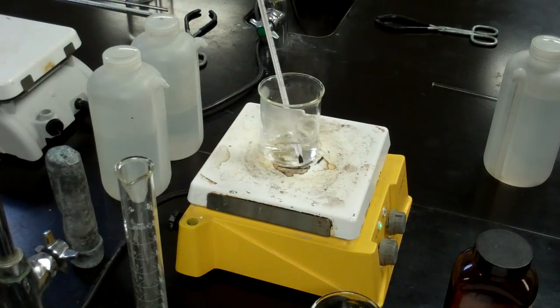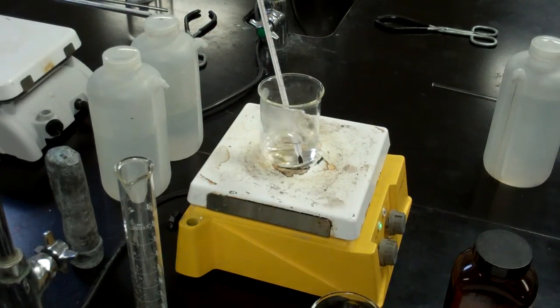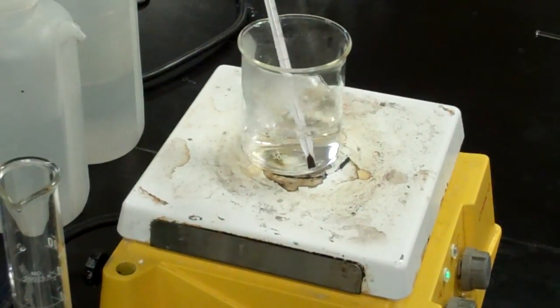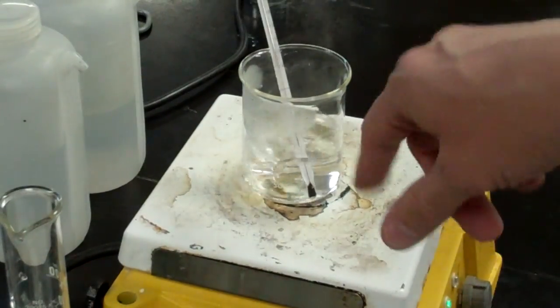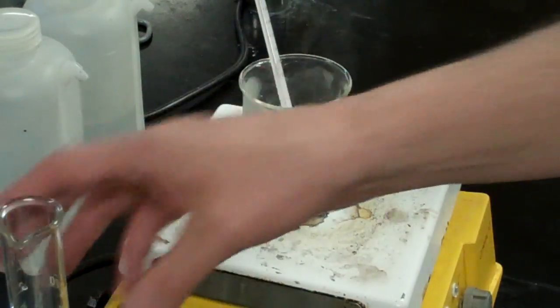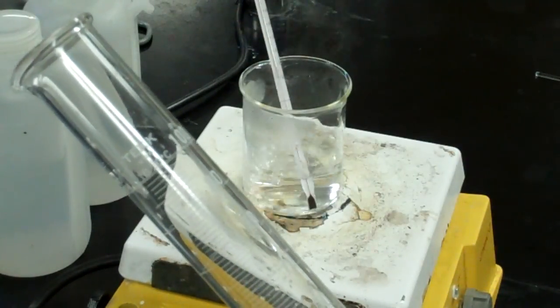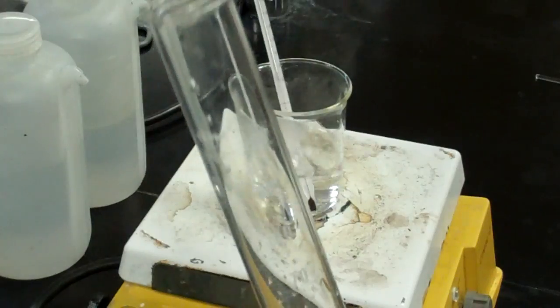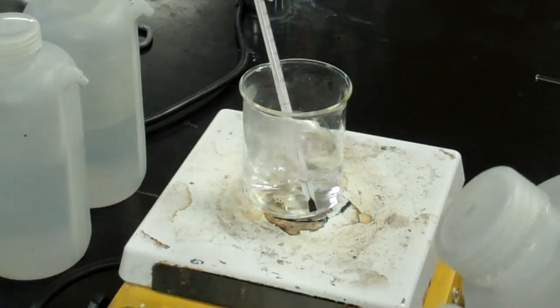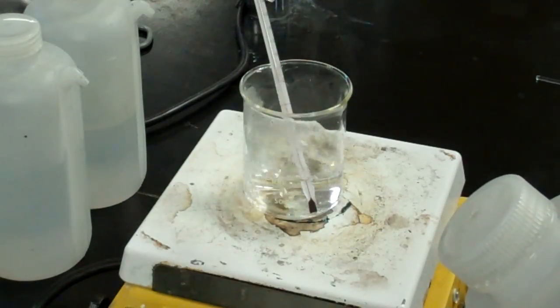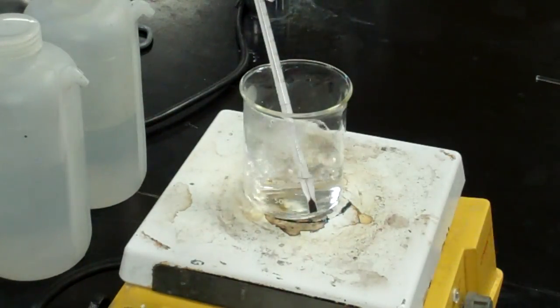Basically what you're going to do is you're going to get a beaker of water and you'll set it on your hot plate. By the way, we can fit two beakers on each hot plate so you'll be sharing that with a group member. You will place 100 milliliters of water in that beaker using a graduated cylinder. You'll want to put this on a level surface and you can fill this up to the 100.0 mark.